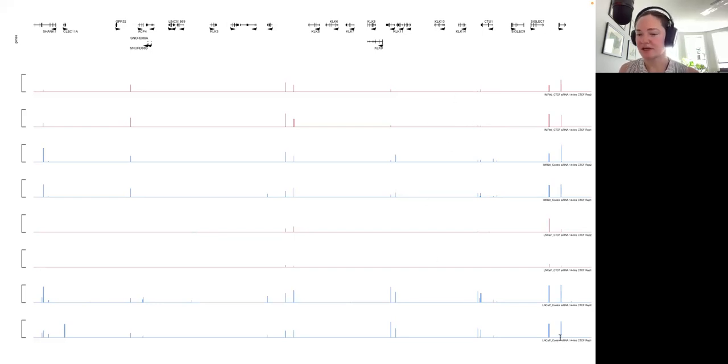Okay. And the cool thing is this seems to be consistent across cell types. So regardless of whether it's those lung fibroblasts here on the top 4 lines versus the prostate cancer cell lines here on the bottom. All right. So kind of cool to be able to take their results in, validate those, and not have to do a ton of work on our own part to download and work on those on our computer.